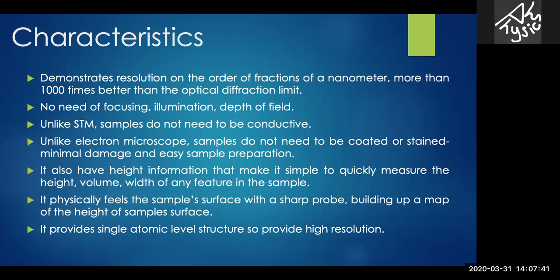It also has height information that makes it possible to quickly measure the height, volume, width, and so on of any feature in the sample. It physically feels the sample surface with a sharp probe, building up a map of the height of the sample surfaces. It provides single atomic level structures, so the resolution is quite high.